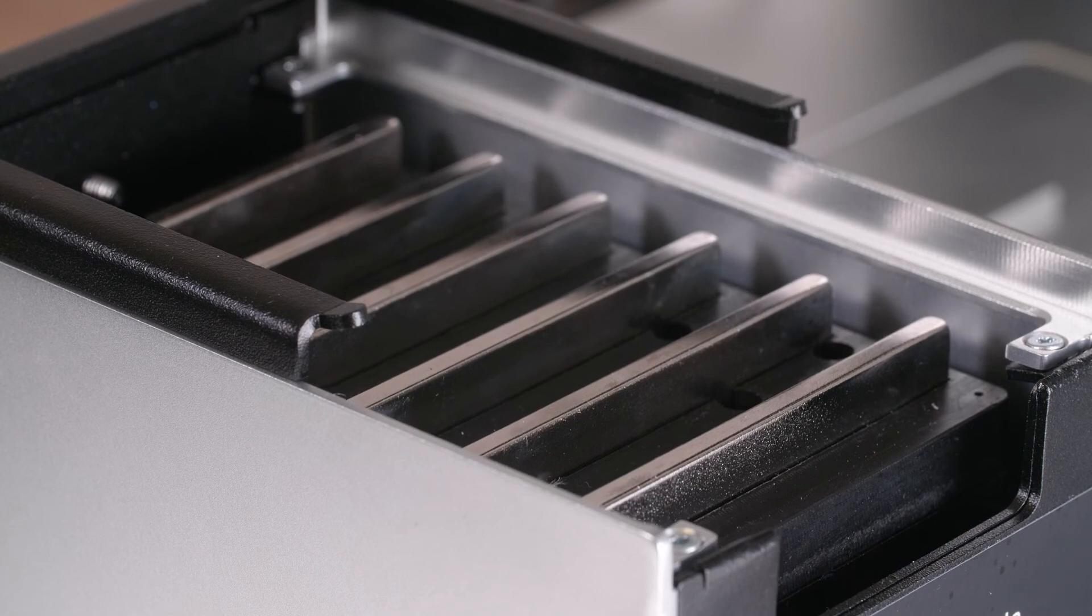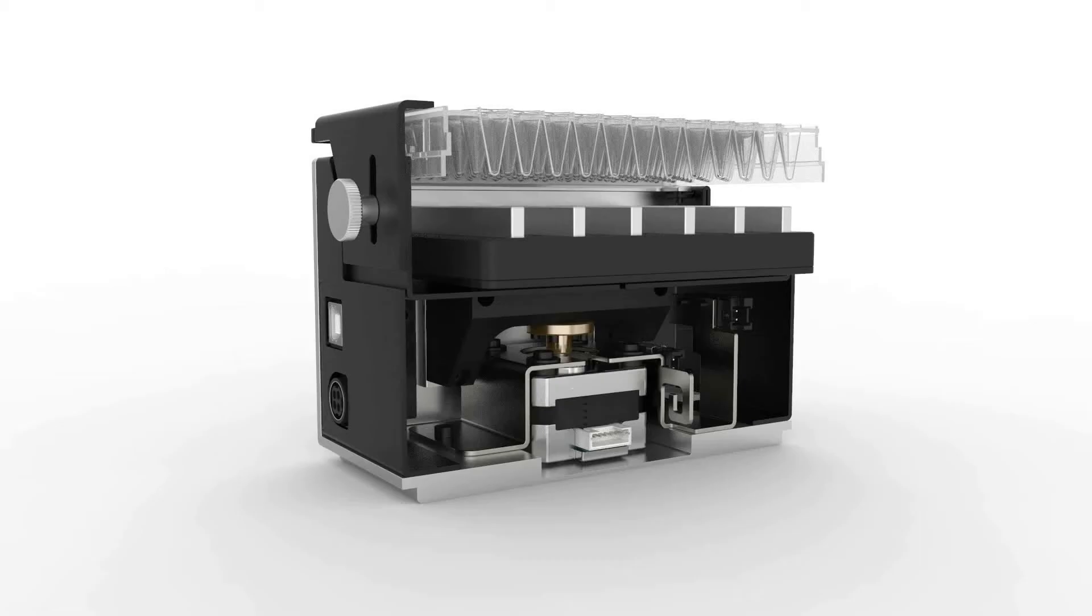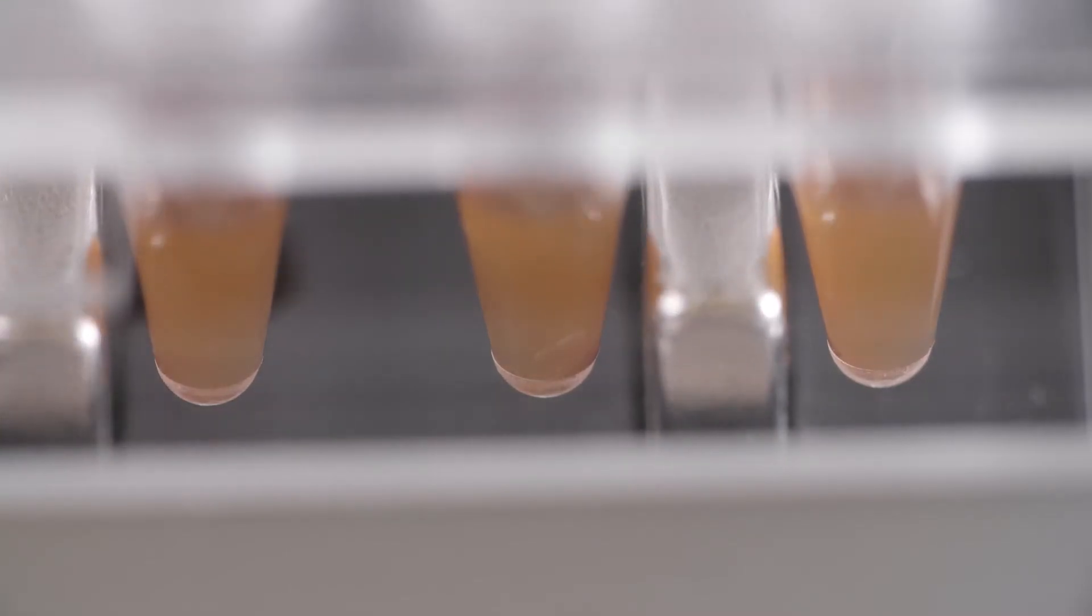While other robotics companies move the labware on and off of magnets, the Opentrons magnetic module works by moving the magnets to and from the labware.